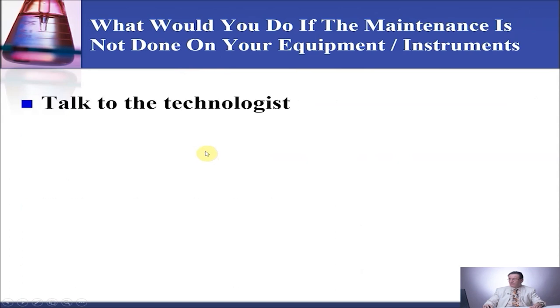What would you do if the maintenance is not done on your equipment or instrument? First, you talk to the technologist who was working on the bench that day or that week. You ask them if they did the maintenance. If they say yes, then let them check and initial. If they say no, they were too busy or forgot, then you circle that day and write down in the problem section. You write that you talked to the technologist, not to miss the maintenance again.